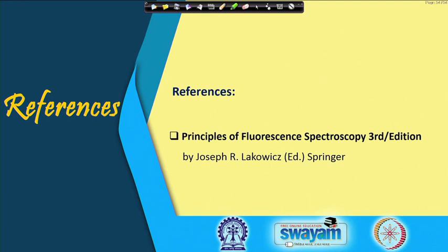The references, this is a book, Joseph Lakowicz, The Principles of Fluorescence Spectroscopy, that practically covers everything related to fluorescence spectroscopy, apart from many references present in the book itself.